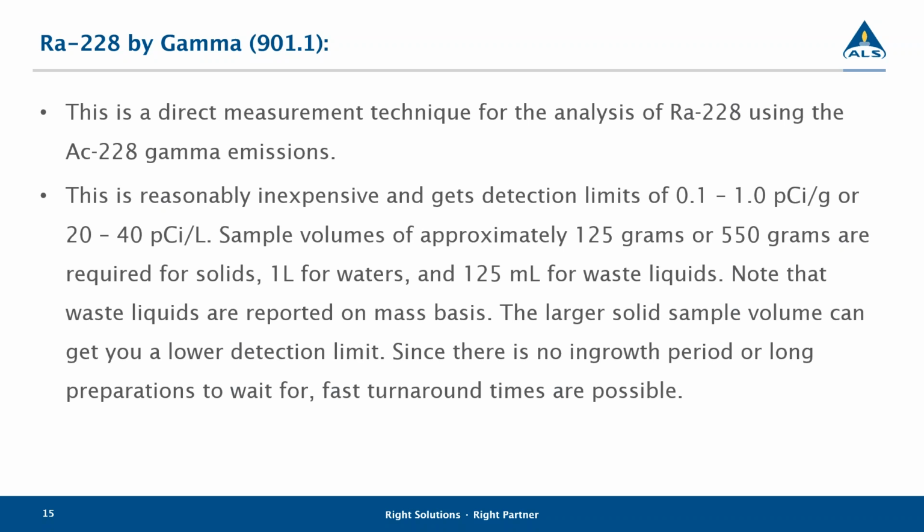This is something that you can actually run in conjunction with the radium-226. So if you're running gamma spec, you can actually count for radium-226 and count for radium-228 in the same analysis.